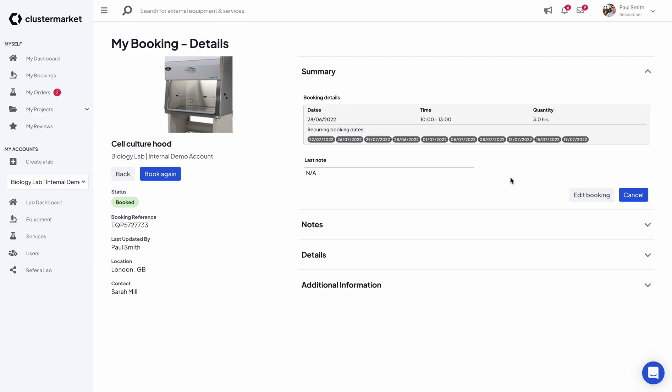So you basically guarantee your place in the cell culture hood for the next five weeks on the specific times you need with just a few clicks. I hope you enjoyed this video. If you have any feedback leave it in the comments. Otherwise enjoy ClusterMarket and enjoy making a lot of recurring bookings. Thank you.